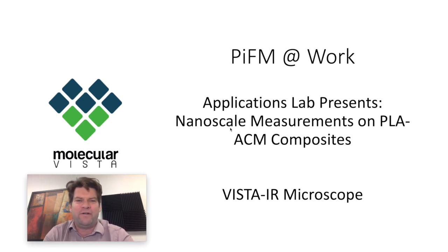This video is part of a collection of videos where we highlight cutting-edge applications using the VistaIR microscope from Molecular Vista. Now in this video, we are going to investigate a polylactic acid and an acrylic rubber nanocomposite. And so we're going to be able to use our PiFM technique to deconvolve both materials, both spatially at the nanometer scale and spectrally at the nanometer scale, showing spectral results that are very much like FTIR results.